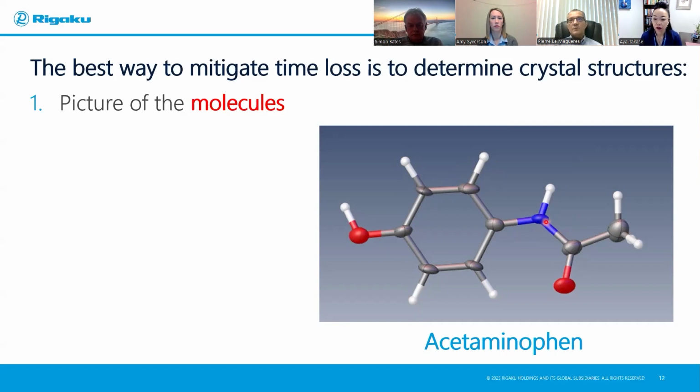Once you have been able to locate all your atoms and identify them, you can see how they link with each other to make up a molecule. And we call that molecular connectivity. So this is really as if you had made yourself really small and gone into your crystal and taken a picture of the molecules with your camera. You actually have a clear picture of the molecule.